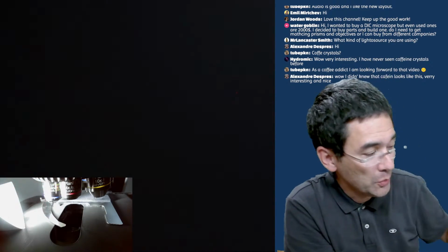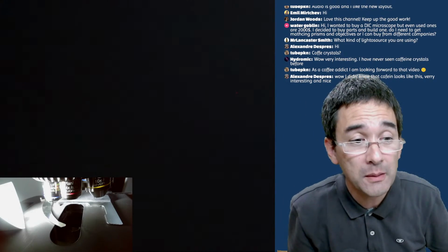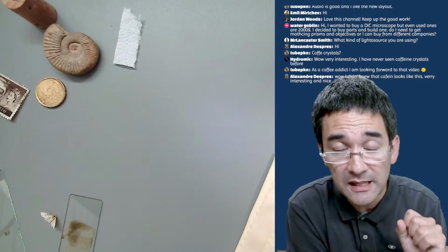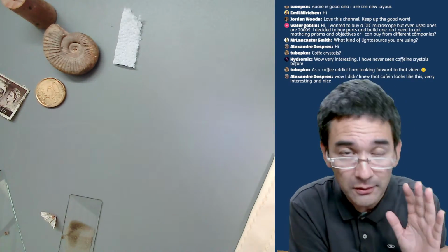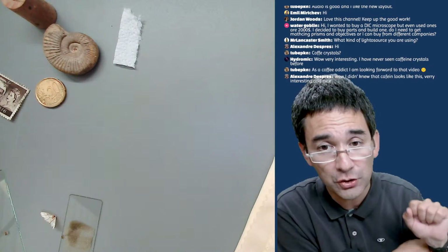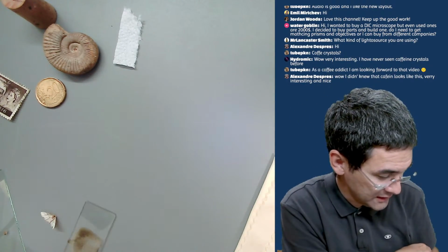And notice that I'm always staying with a low power. By the way, I just also wanted to add this: stereo microscopes that you can get these days generally have a maximum magnification of 40 times. There are some that go higher, but 40 times is basically the magnification that we have here. So, I showed you the sand already.